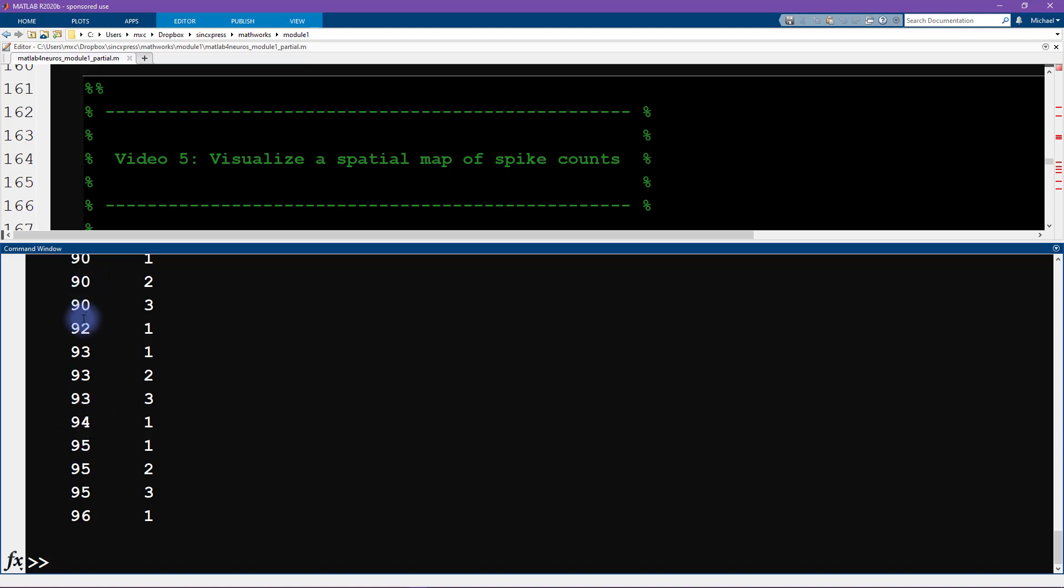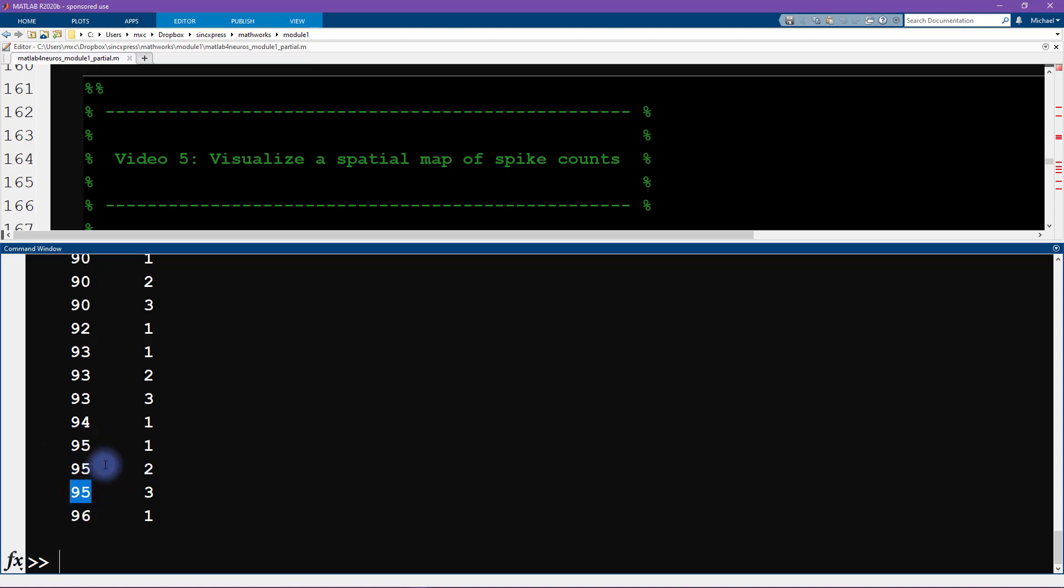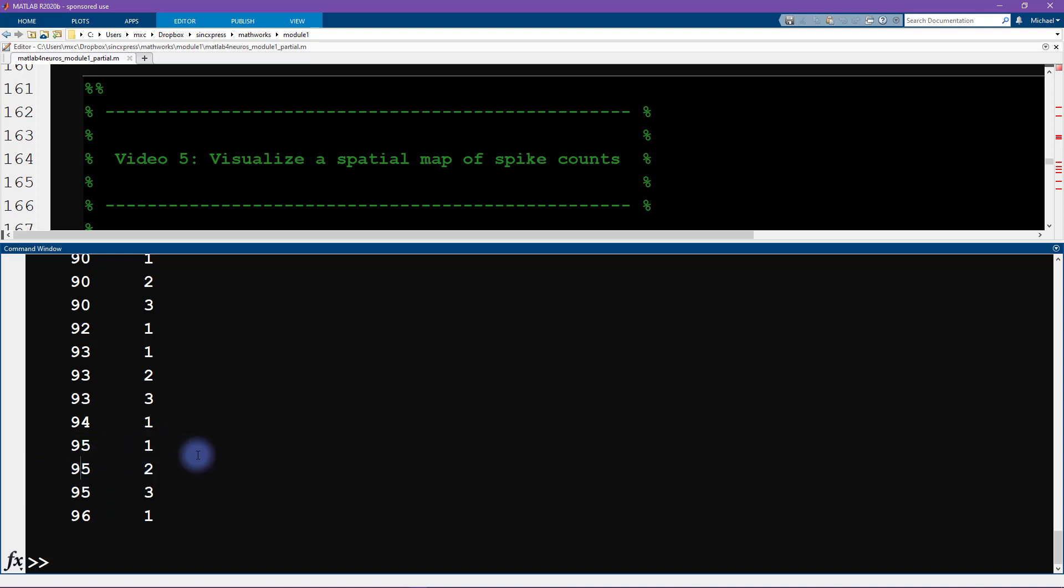So data.channels tells us this provides a mapping of each of these units here, each of these 106 neurons, and which channel in the data set, in the grid, that that neuron was recorded from. So we can type data.channels. And here you see we are interested in the first column here. So this column is telling us that the last neuron in the data set, so this is neuron 106, it was recorded from channel number 96. And here we see three times 95. So this means that these three neurons in the data set, so neuron 105, 104, and 103, all three of those neurons were recorded from the same physical channel. And that physical channel is called channel number 95.